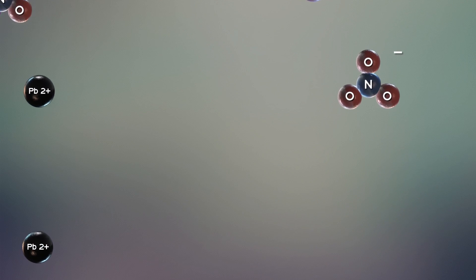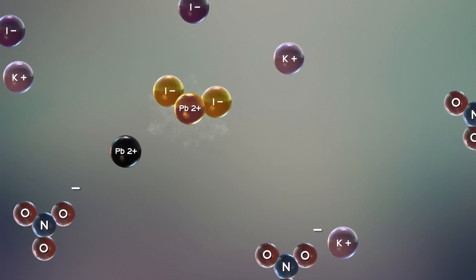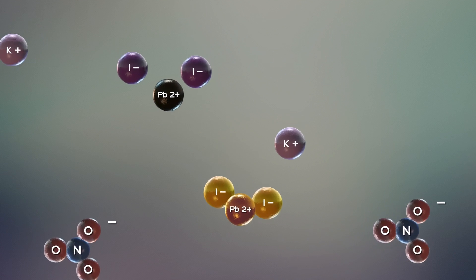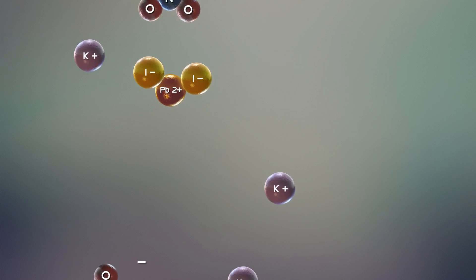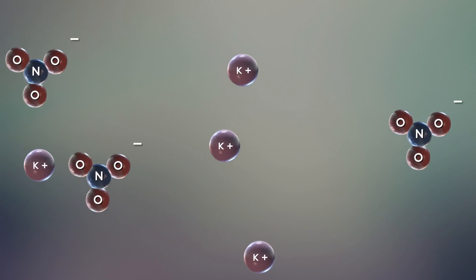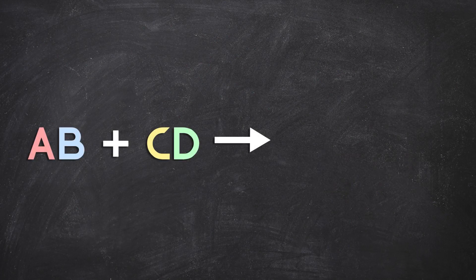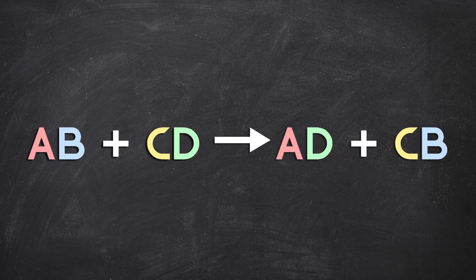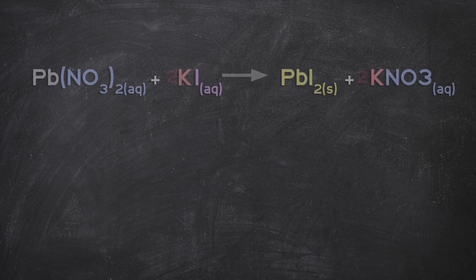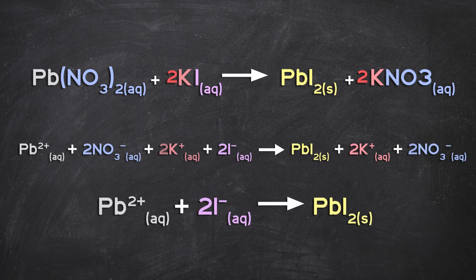We're looking at a solution of lead(II) nitrate. With addition of potassium iodide, the lead and iodide ions will collide and form lead(II) iodide, a solid. Leftover is a solution of potassium nitrate. In these reactions, the cations and the anions switch places, forming two new compounds. From this, we can find the molecular equation and both of the ionic equations. So, let's look at the solubility of our product.